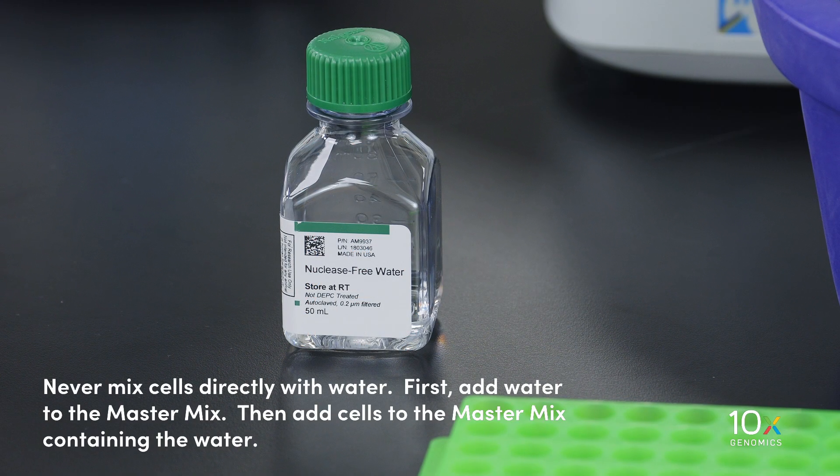Never mix cells directly with water. First, add water to the master mix. Then add cells to the master mix containing the water.